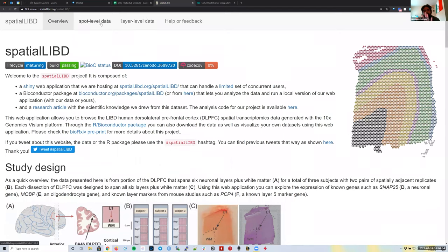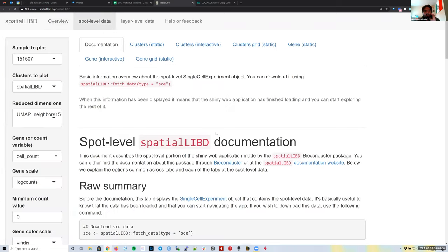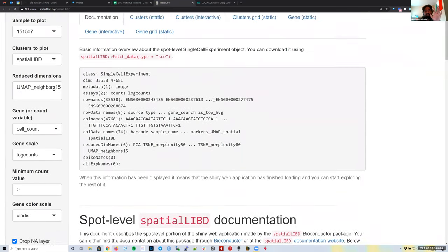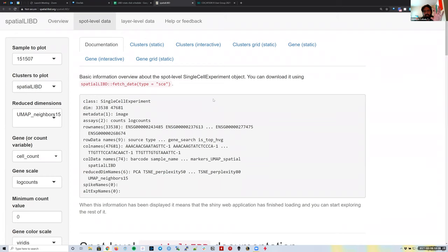The website has two main panels at the top: one called Spot Level Data and another called Layer Level Data — almost like two different web applications inside this one website. Let's look at the Spot Level Data first. This tab allows you to visualize every single spot for all 12 Visium slides.